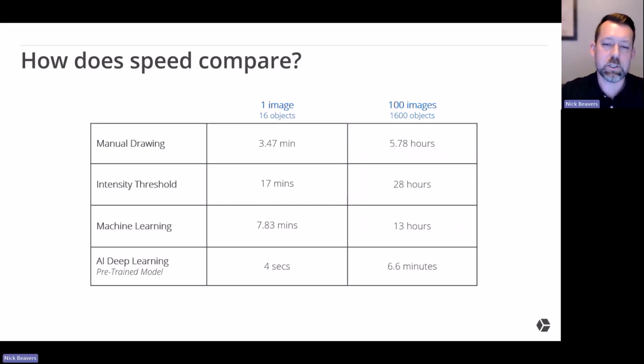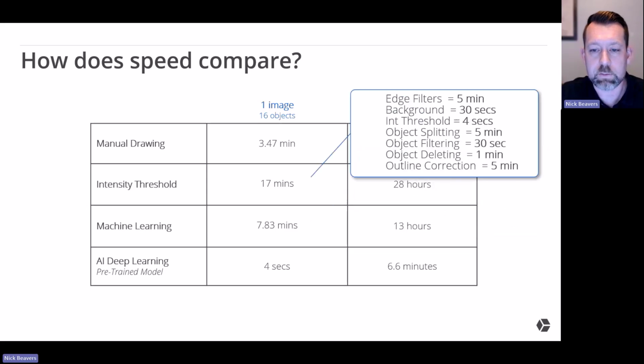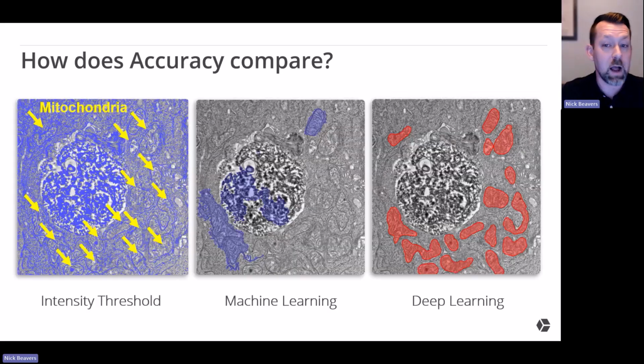Now, let's just state the obvious. Everything I'm saying here today is talking about images that might be a little bit complex, looking at the image I showed just a moment ago. So these types of images are obviously going to be incredibly complicated, very difficult to analyze. If you're working with very dark objects on a white background and they have a really simple shape, then obviously we're going to recommend you use intensity thresholding. That makes a lot of sense. So today, if you're working with fluorescent cells and all you're doing is bright nuclei, DAPI stained counting, you can probably use just an intensity threshold.